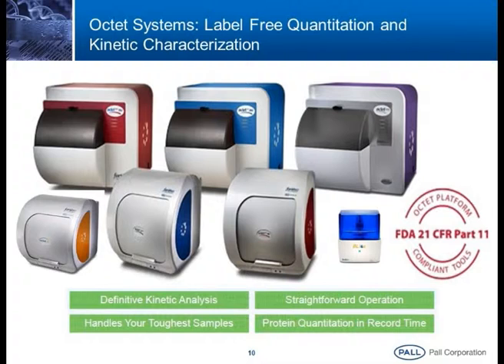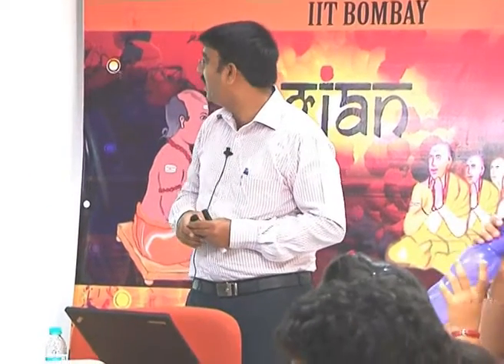And here, for the red instruments, we can see the dynamic range. The maximum we can go from 10 picomolar to 1 millimolar. And size-wise, we can perform interactions such as small molecule protein interaction, protein interaction, vaccines, live virus, bacteria and all.